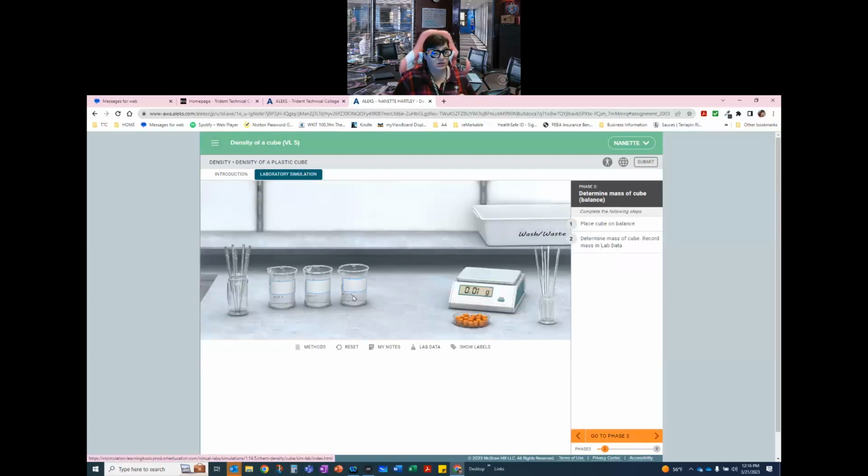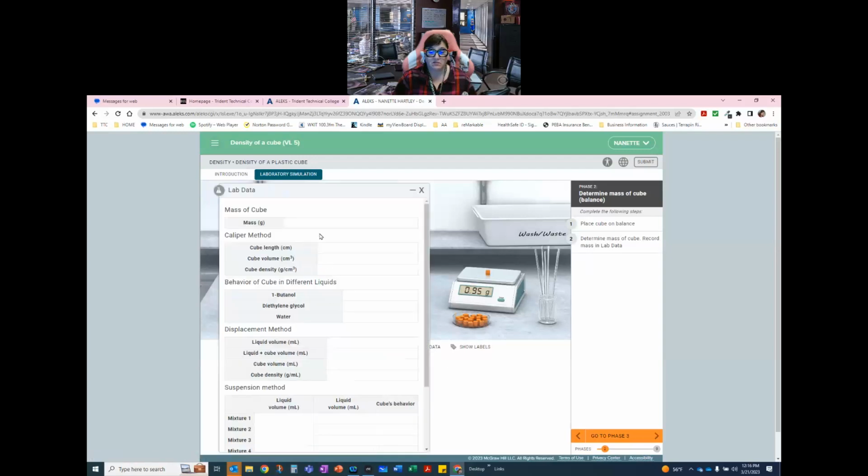So it's very straightforward as to what it's asking you to do for this. So pick this up, we put it on the balance, woohoo! I have to record that number.